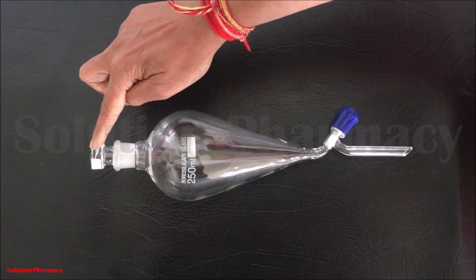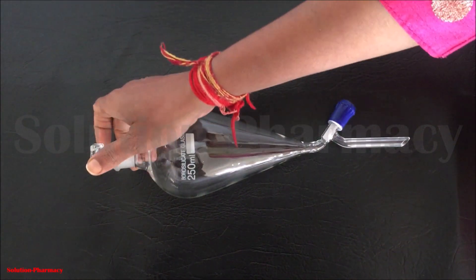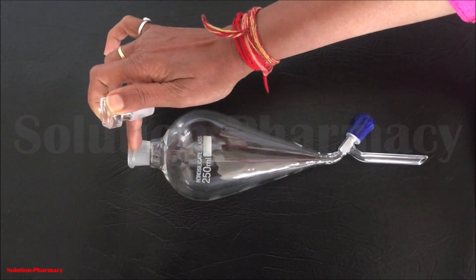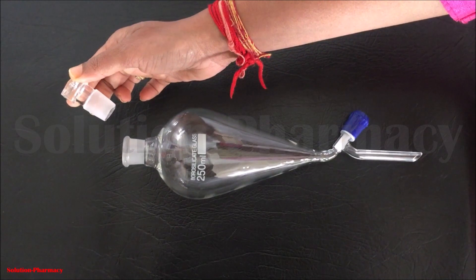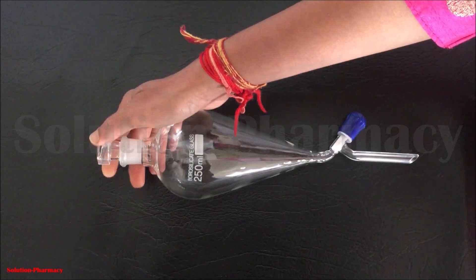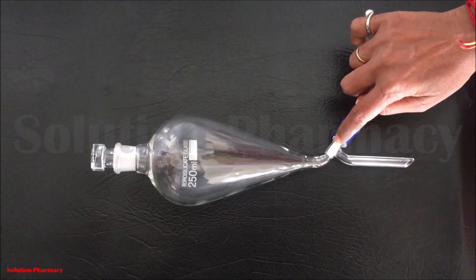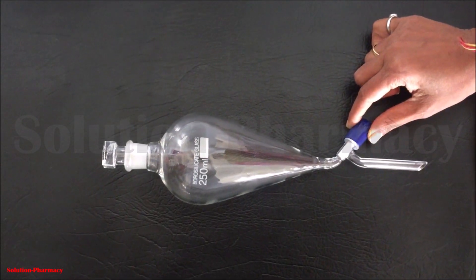At the top, this is the glass stopper of the separating funnel. When we drain out the liquid we have to remove this stopper, and when we shake or perform extraction we have to tightly close the separating funnel with this glass stopper. In the conical-shaped part we fill the liquid mixture which we want to separate.